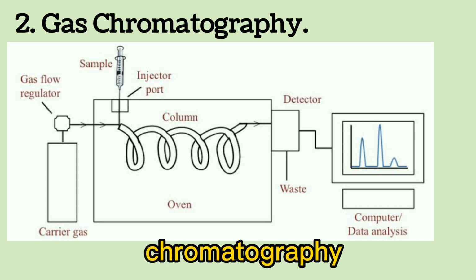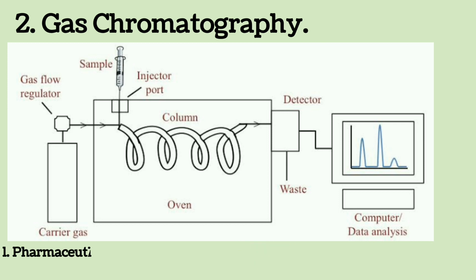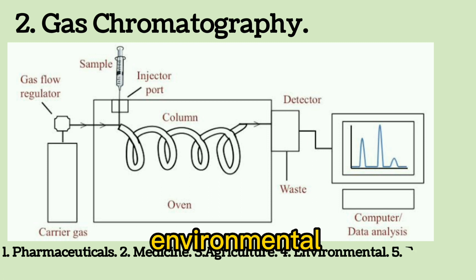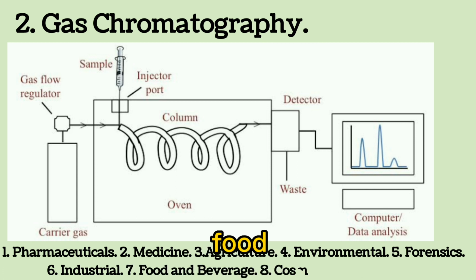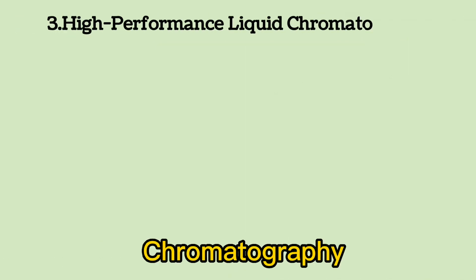This method of chromatography is used in the following industries. 1. Pharmaceuticals. 2. Medicine. 3. Agriculture. 4. Environmental. 5. Forensics. 6. Industrial. 7. Food and beverage. 8. Cosmetics and cleaning.